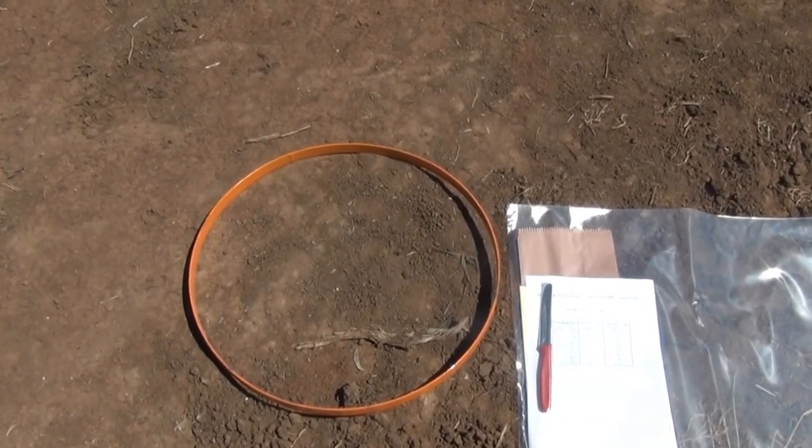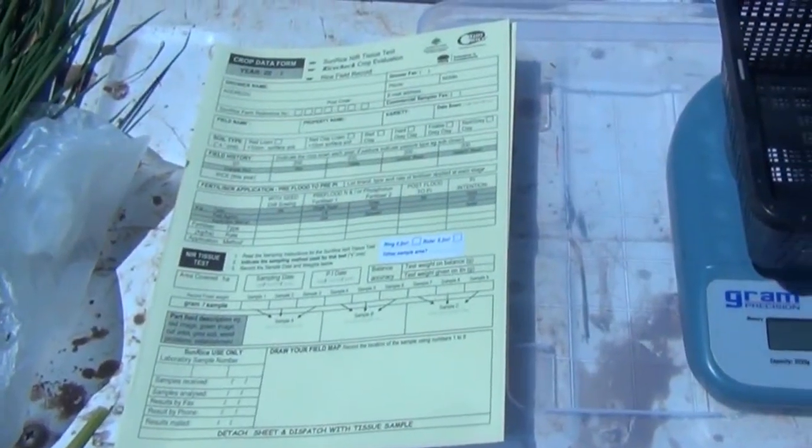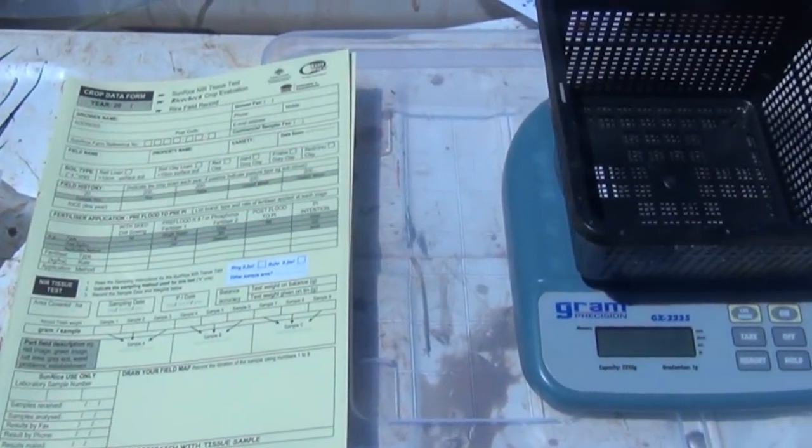Before heading to the paddock, grab the gear you will need, such as the sampling tube, bags, a good knife, the submission form, and some scales.